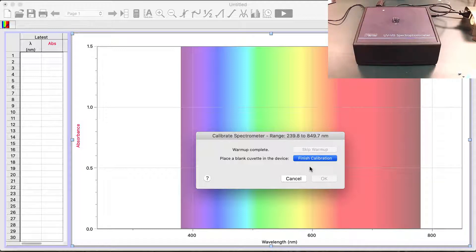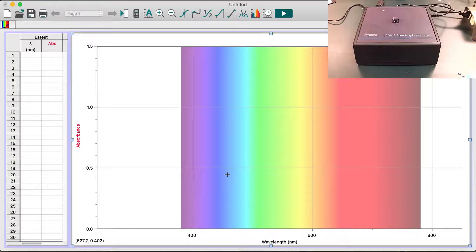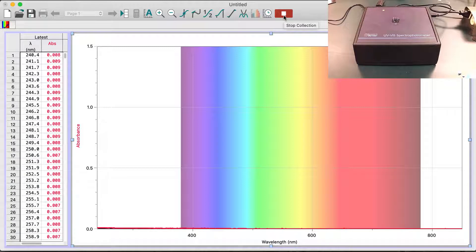What this does is measure the absorbance — or really, it measures how much light is transmitted through the sample at all the different wavelengths you have set up for it to measure. For example, if I then tell it to measure this sample like it's an unknown, you'll get just a flat line across showing that the amount of light going through at all these different wavelengths is the same as it was before.